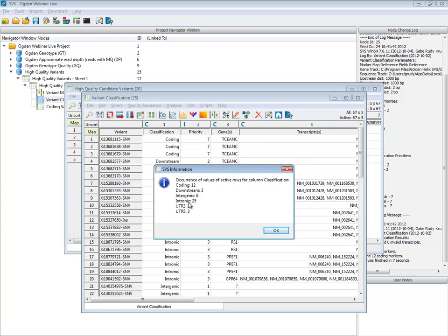12 here, but what's going on is that exome capture expands across just exons to show some variance in the UTRs and introns and up and down. They're focused or centered around exons, but they definitely are going to catch variance outside of just the exonic region.